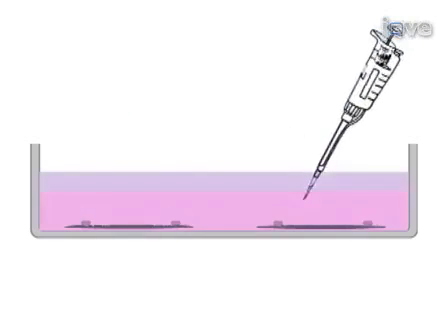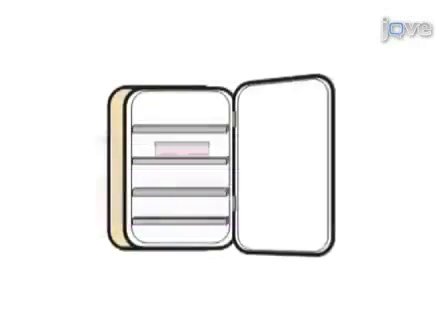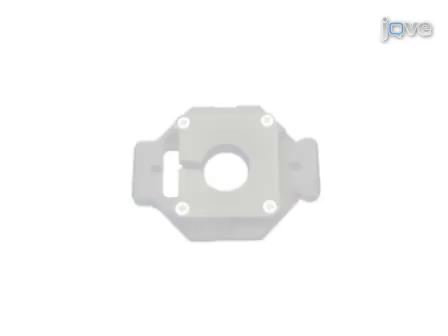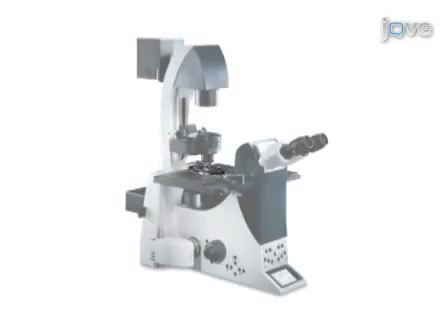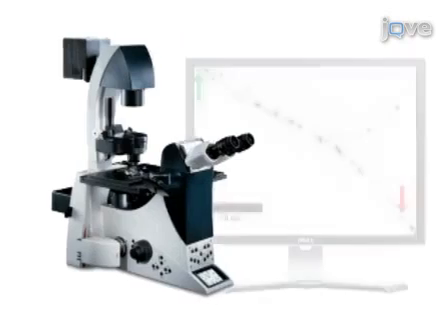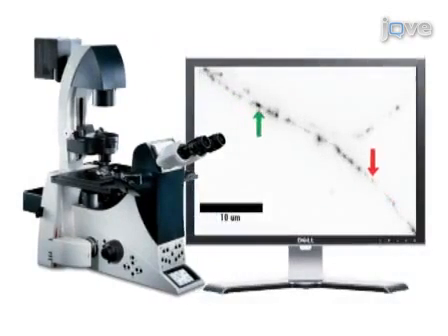Since hippocampal neurons are cultured on inverted cover slips facing a glial monolayer, these cover slips must be turned over in order to expose them to the transfection reagent. After allowing ample time for expression of GFP-tagged dense core vesicle proteins, an imaging chamber is constructed and imaging of dense core vesicles in cultured neurons can be performed using wide-field fluorescence microscopy. This protocol is flexible and can be adapted to image other organelles such as mitochondria, endosomes and peroxisomes.